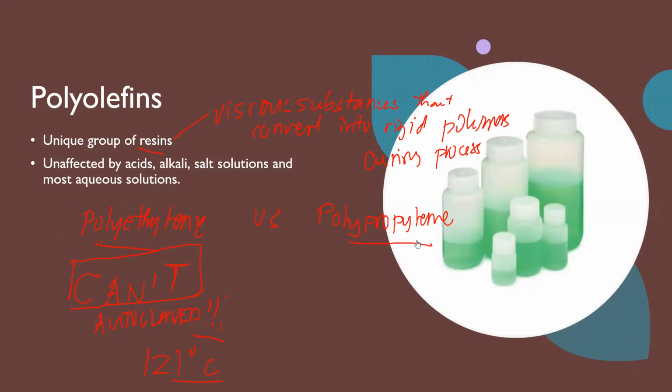Well, on the other side, your polypropylene naman can be autoclaved. No? Can be autoclaved. However, it absorbs pigment and becomes discolored. Yun lang yung problema. Pero you can autoclave. The purpose of autoclaving, I am sure naman that you are all aware of what is an autoclave, no? This is used for sterilization.